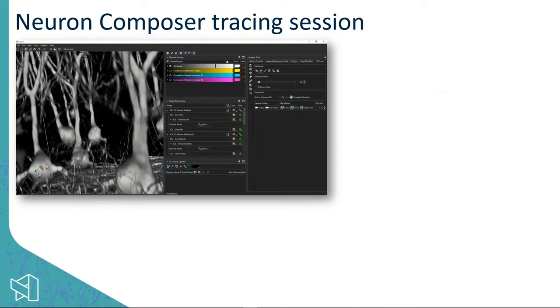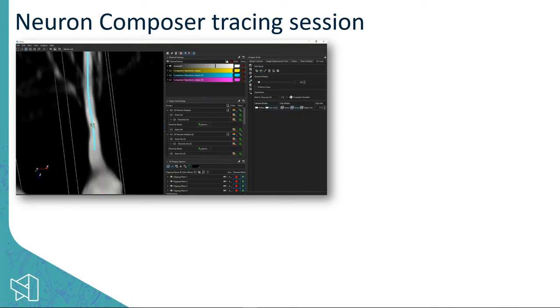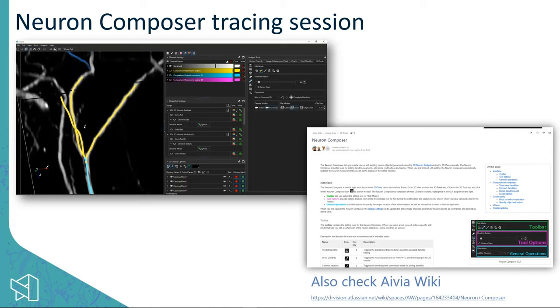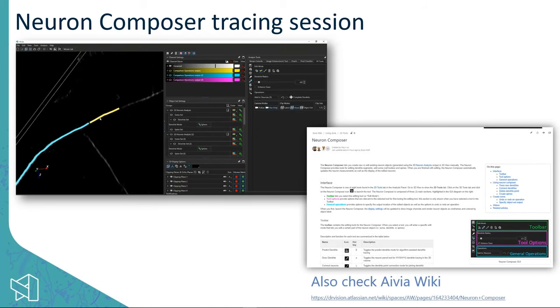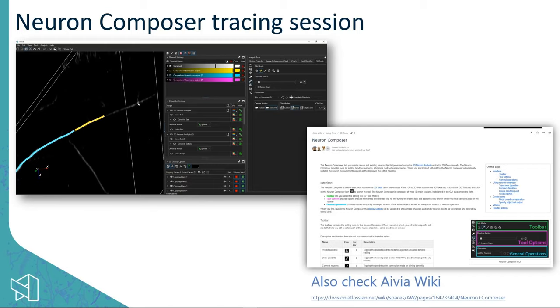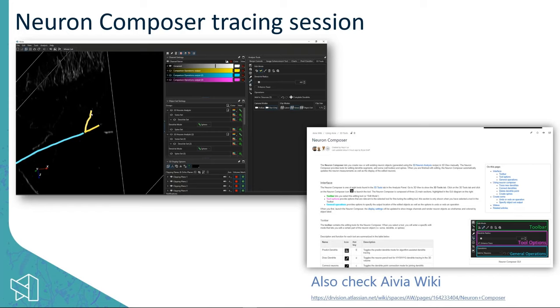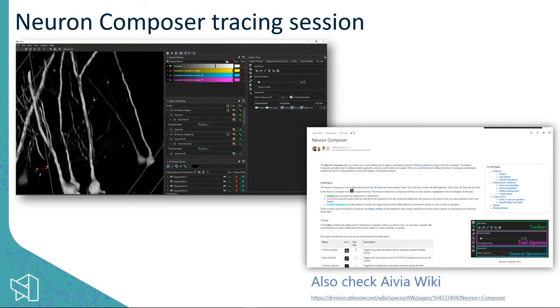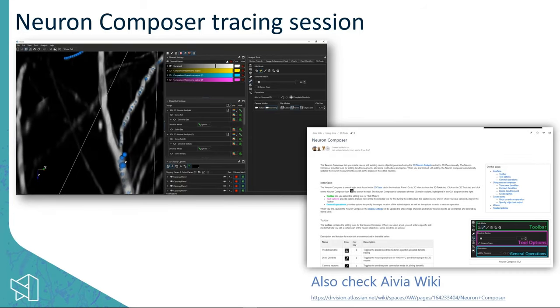With the segment prediction mode, you click in a location and Avia will predict and propose a number of paths. All you have to do is select the one you're interested in — Avia will validate that point, calculate another trace in front of it, and you run that process over and over. The connections are done automatically, and if you click on a location that already has a trace and then click somewhere far away, it automatically creates a branch. This tool offers a good trade-off between automation and control.